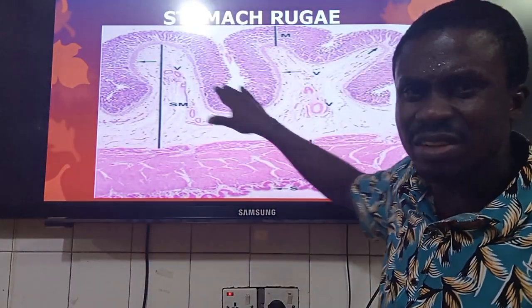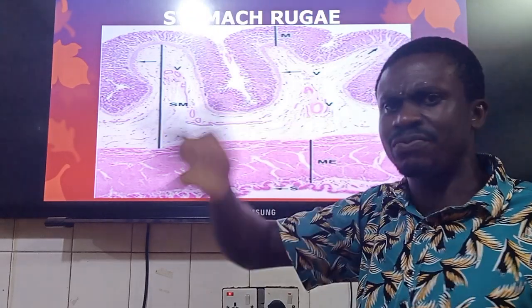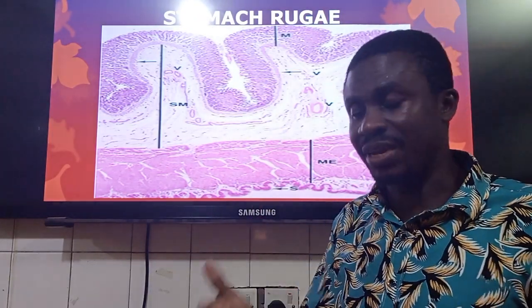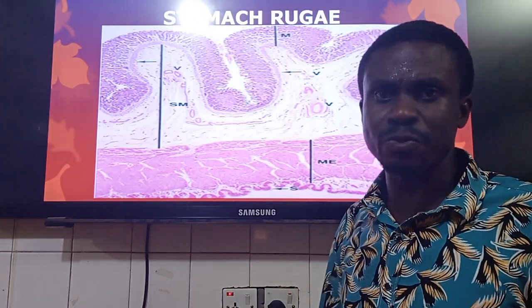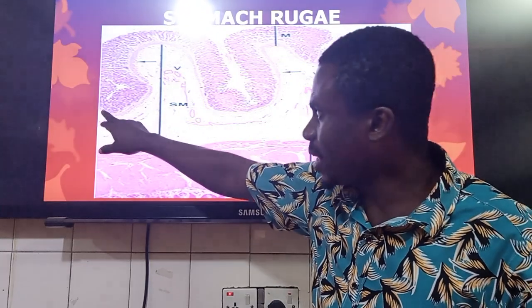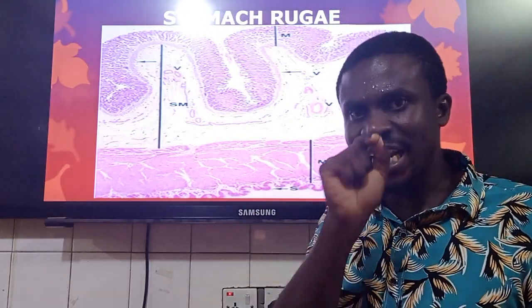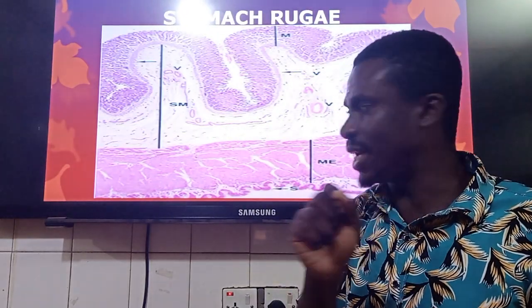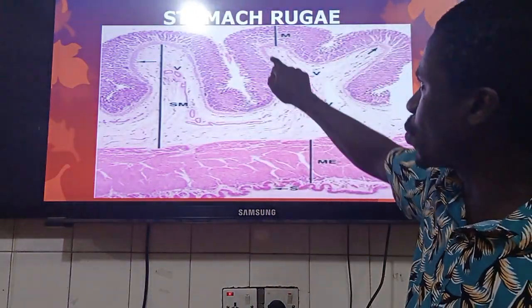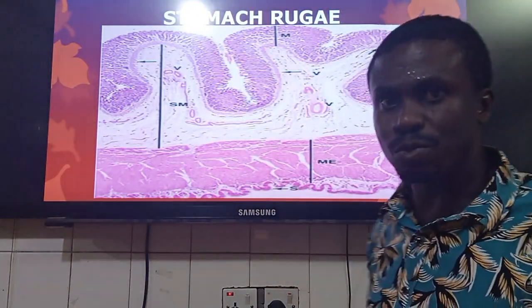And then the stomach will have this kind of gastric gland, okay, whether it's in the fundus gland, cardiac glands, or if it's in the pylorus, pyloric glands, okay, yes, they'll be having all those glands over there. But those glands are in the lamina propria. I want you to appreciate that. And then, of course, that is your muscularis mucosae, exclusively made up of smooth muscle fibers.